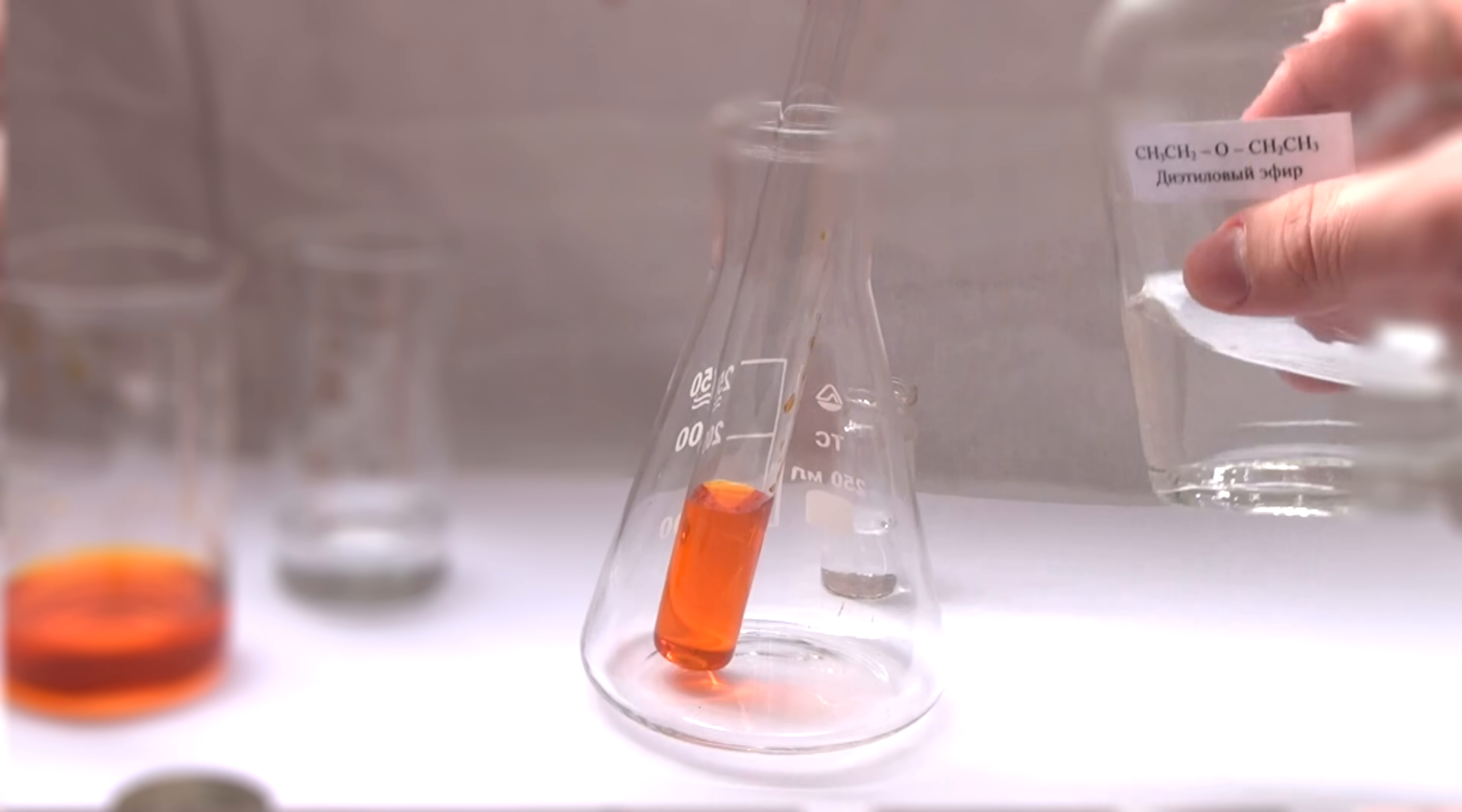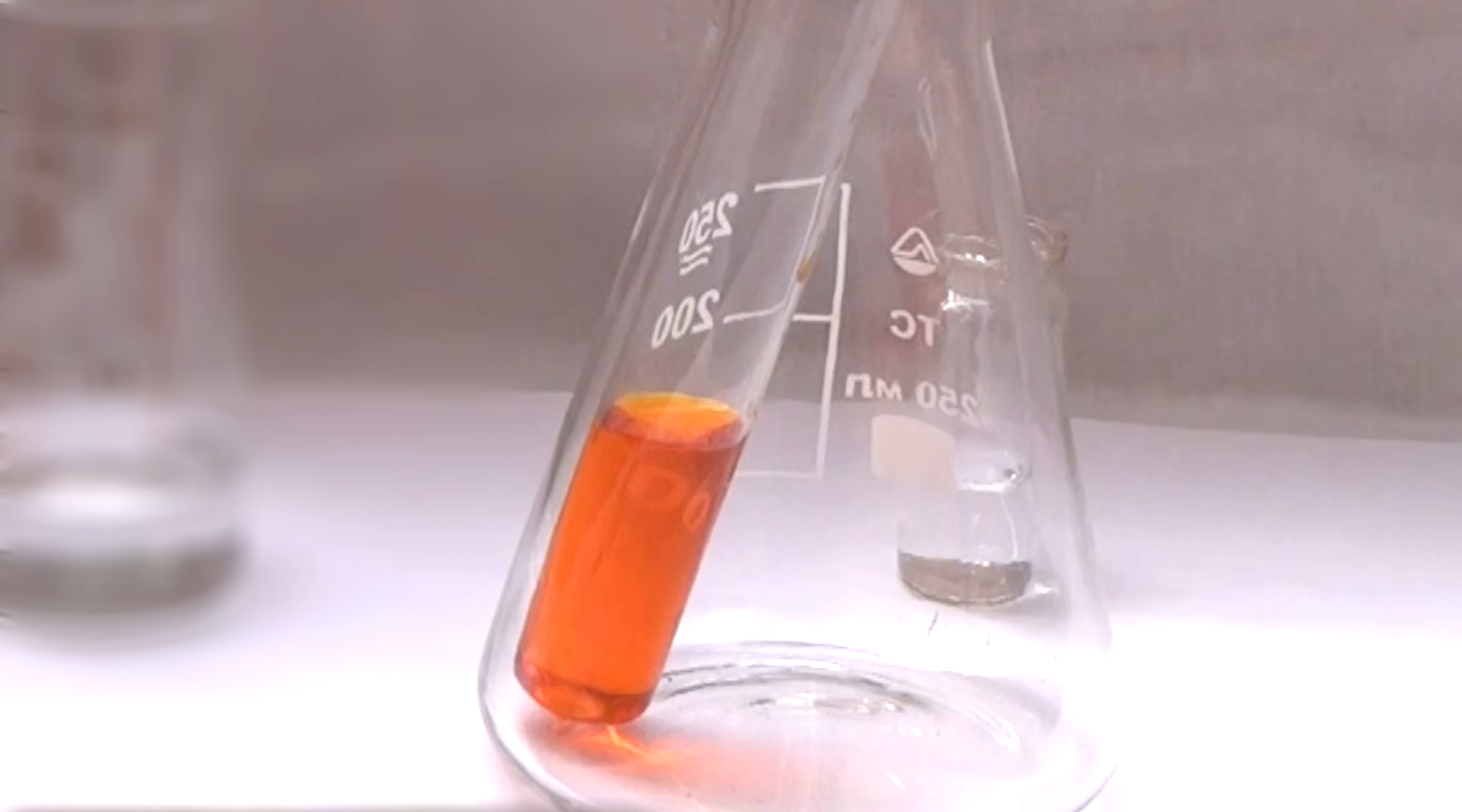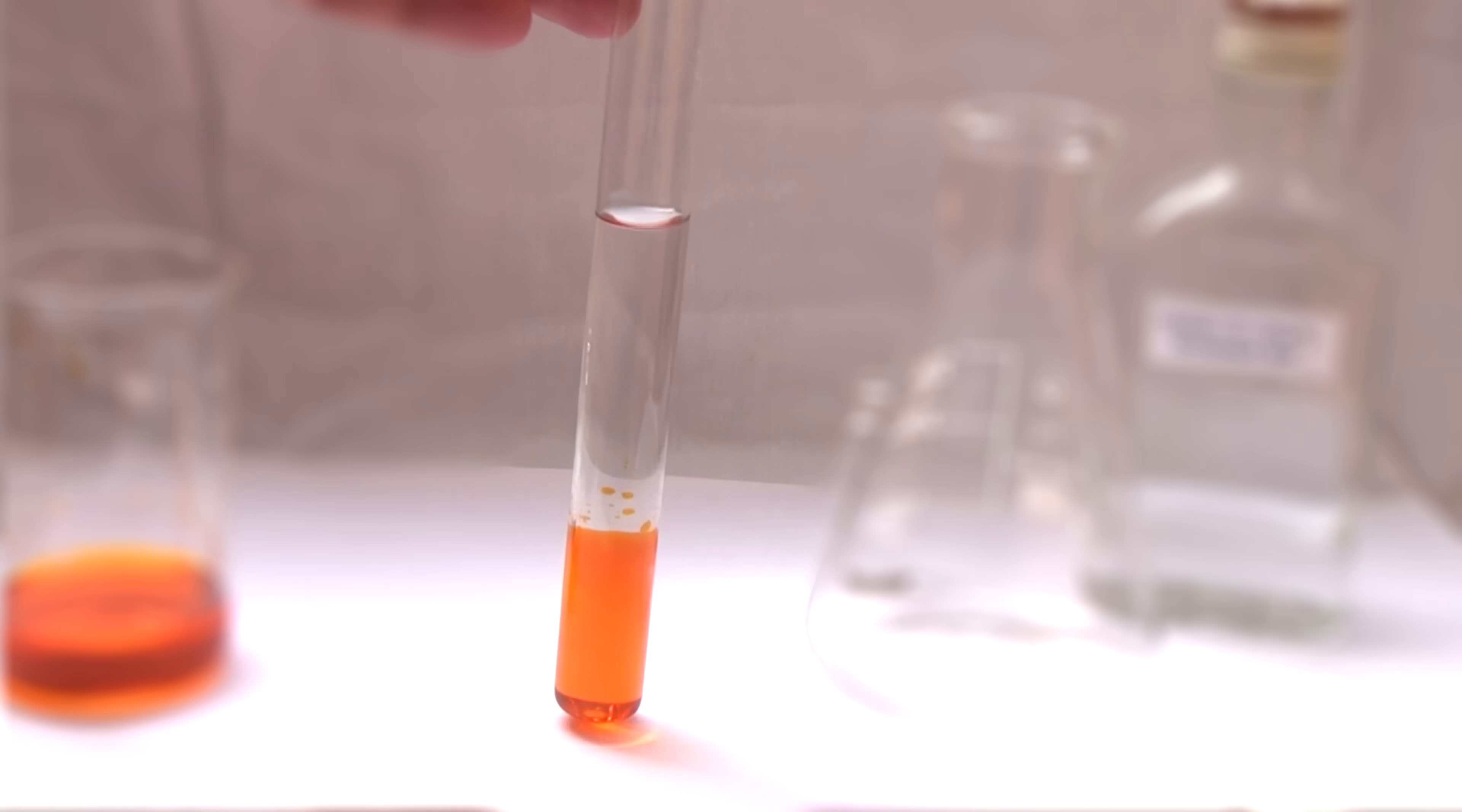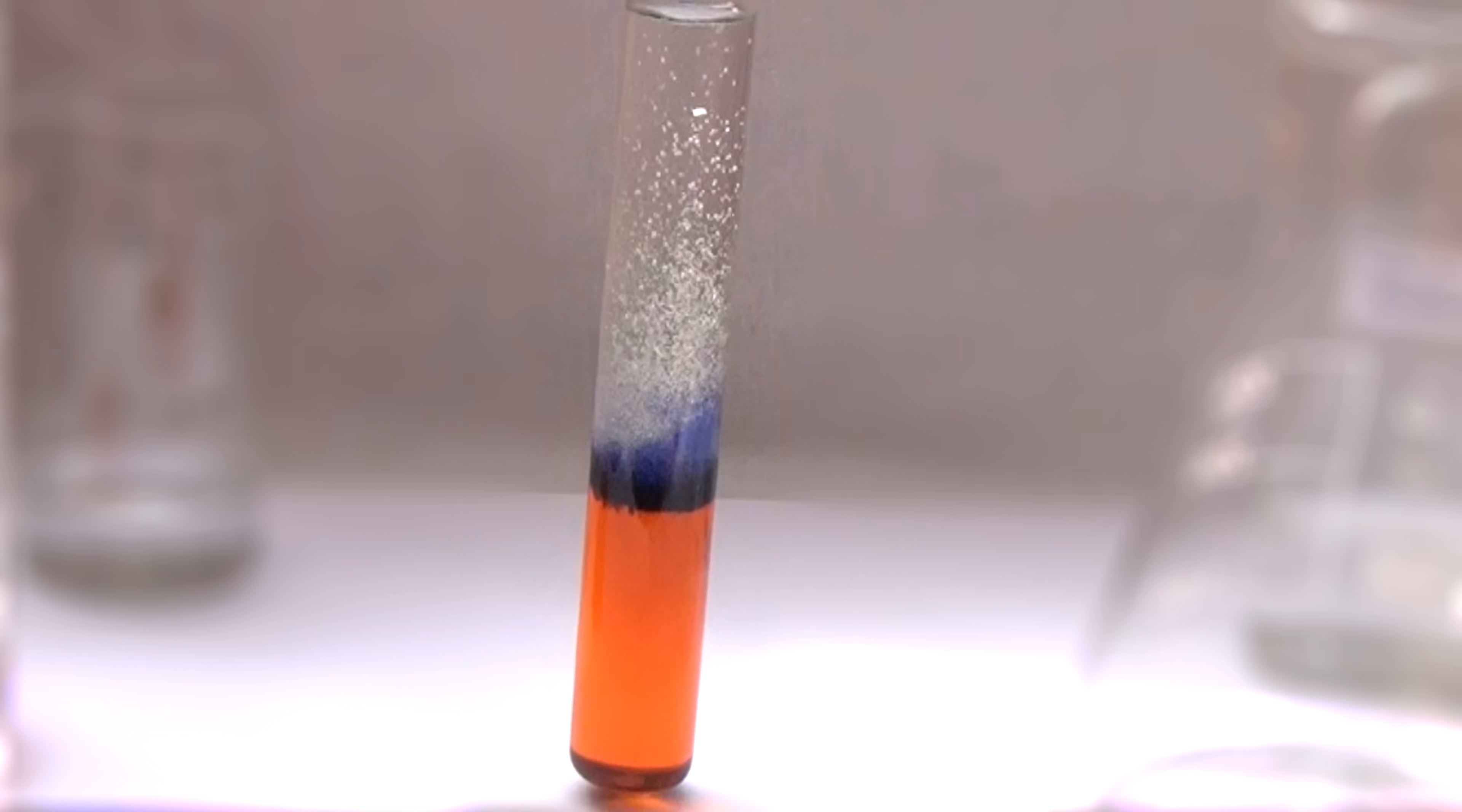To conduct this experiment, we will need a solution of potassium dichromate. Next, we need diethyl ether. Diethyl ether has a low density, so it will float on the surface of the solution of potassium dichromate. Next, add a small amount of sulfuric acid solution to our mix.